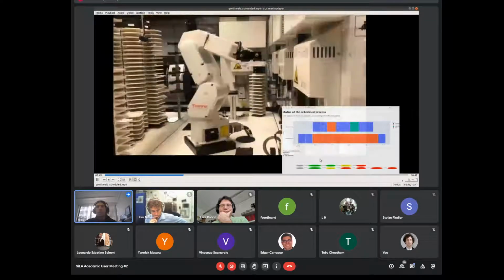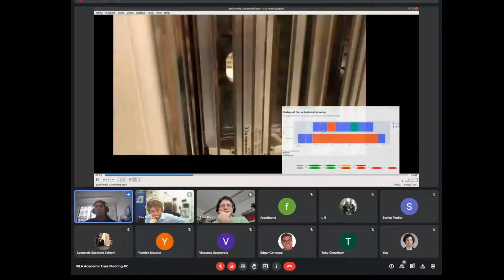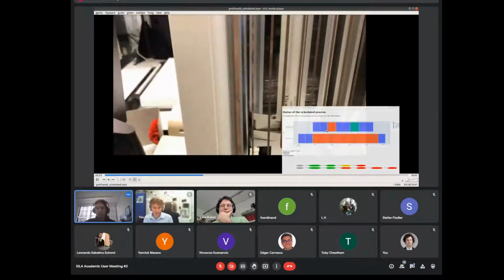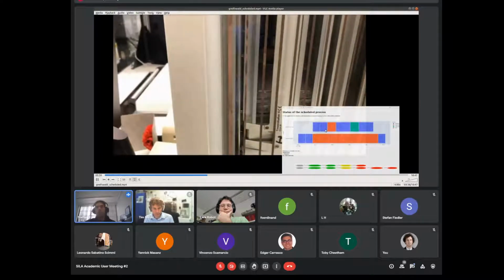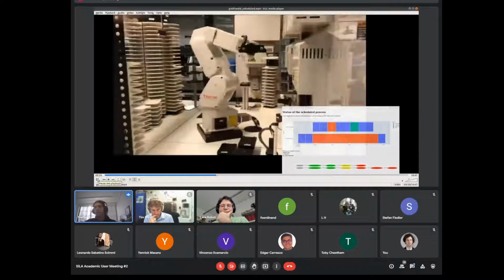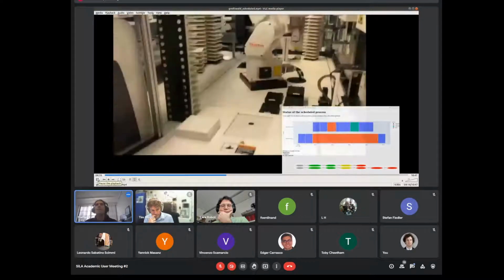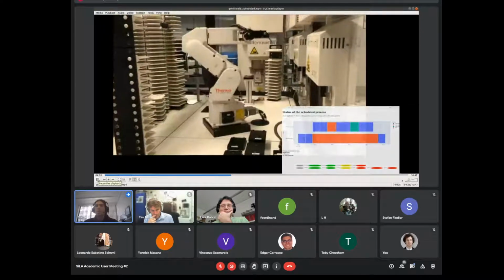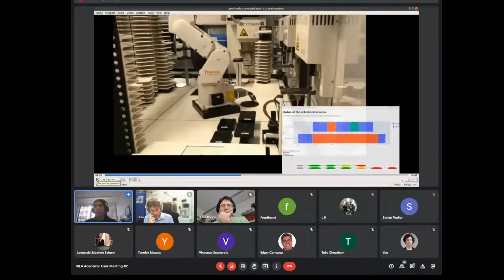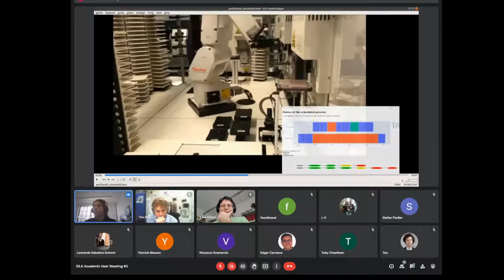What you can see is that it's not always the same. Sometimes the job is done before it is planned to finish. In that case, the scheduler could do a reschedule to apply a quicker one, or just let it waste the time. Yeah, there you're seeing my laptop. Now it's going to be brought from the cytomat to the plate reader. I'm going to stop here and make it a bit slower because this gets interesting.